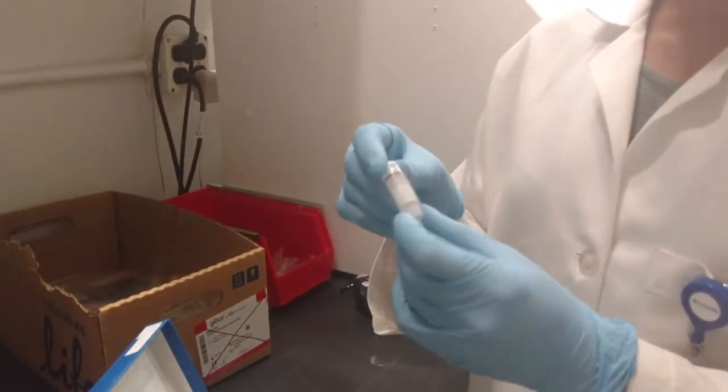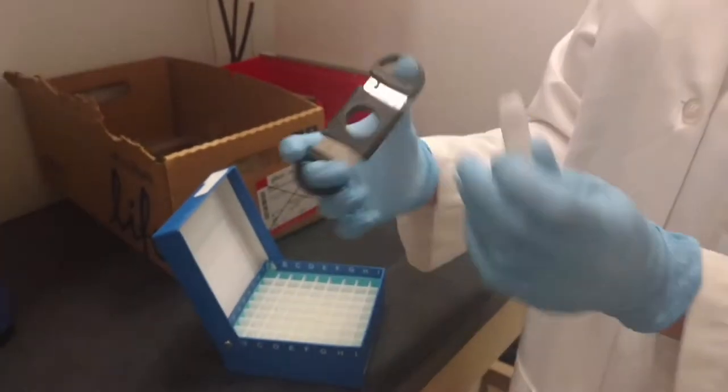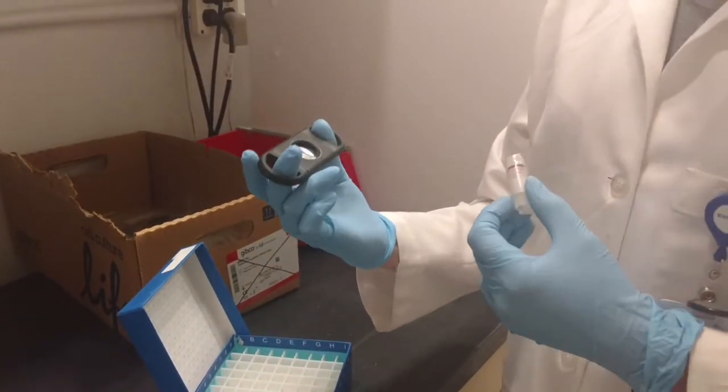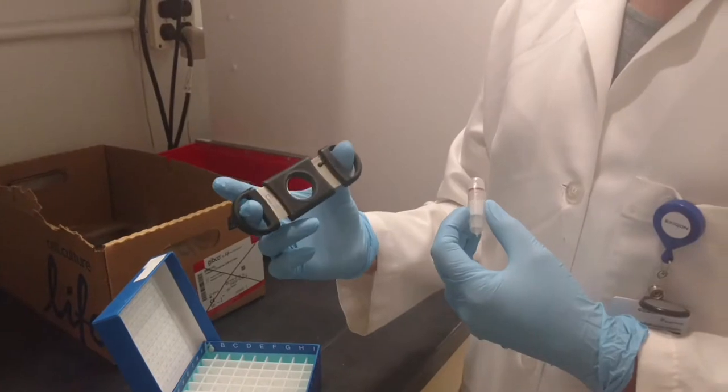The cryovials will be inside this overwrap. If you have a collection with us, you should have been provided or will be provided upon request a cigar cutter.